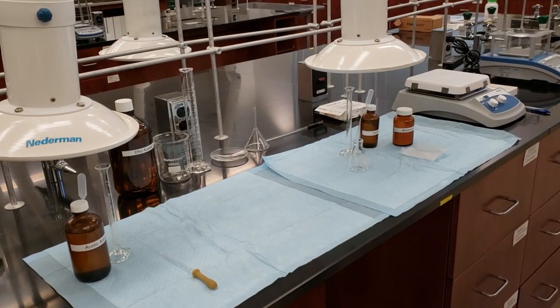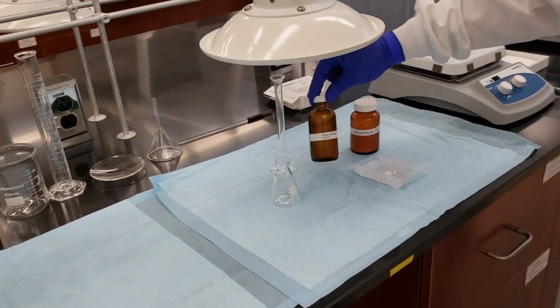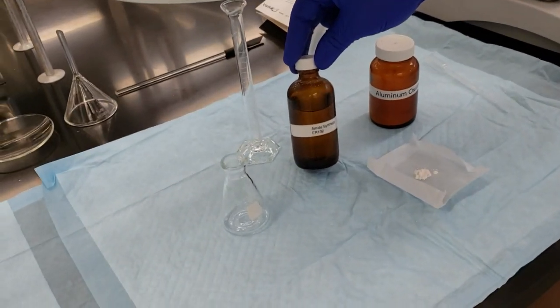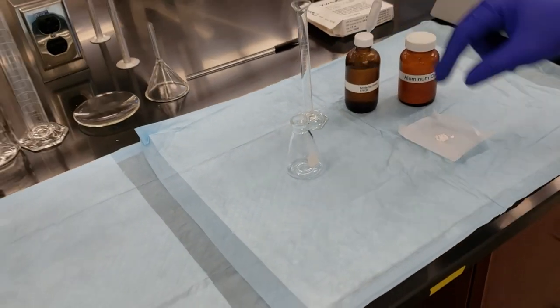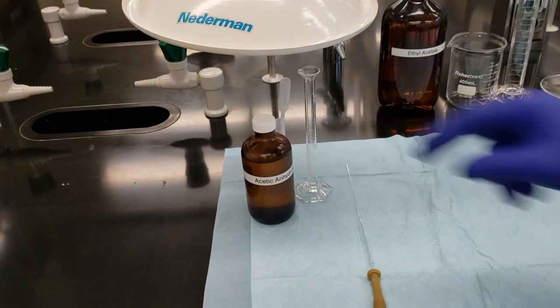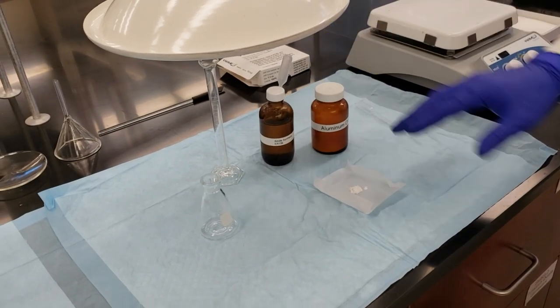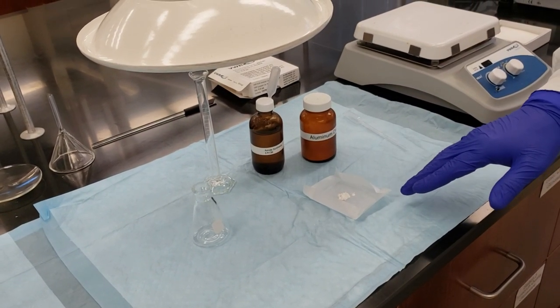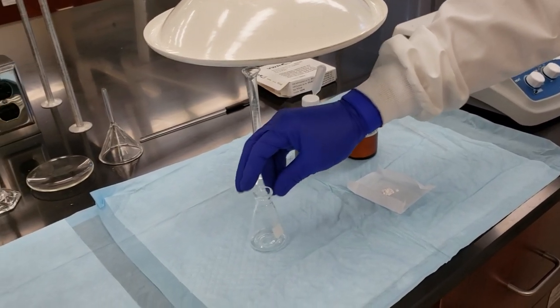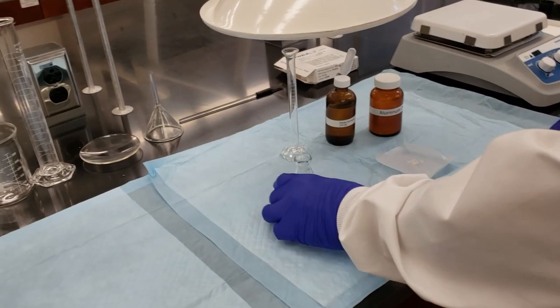CHEM 2212, amide synthesis. So today we're going to be combining an unknown amine, and our unknown code here is ER139, with acetic anhydride in the presence of our aluminum oxide catalyst. We've already weighed out the appropriate amount of our catalyst. We're going to combine it into our reaction vessel, which is a 50 mil Erlenmeyer flask. I'll measure out my amine, add that in, and then proceed with the reaction.